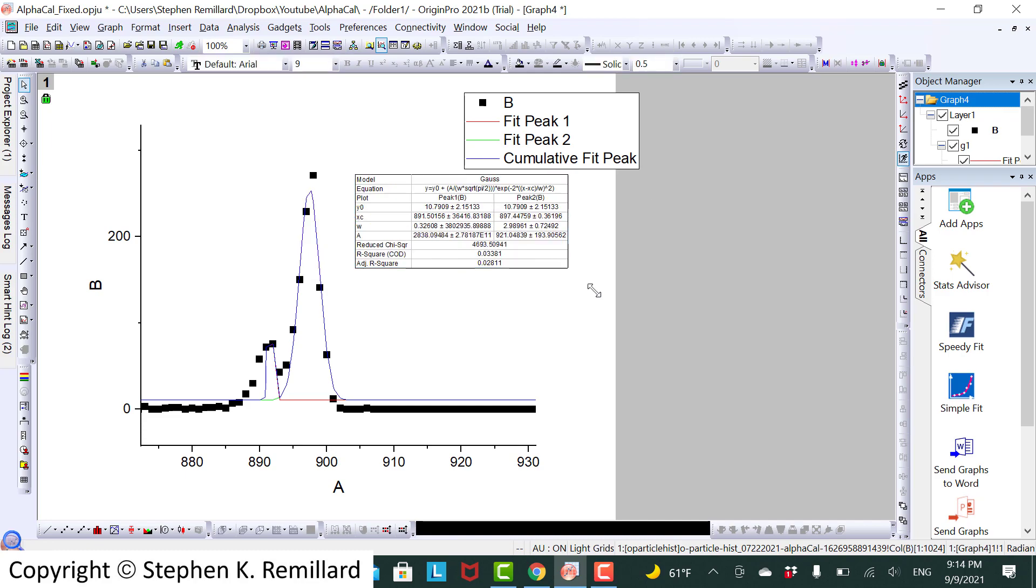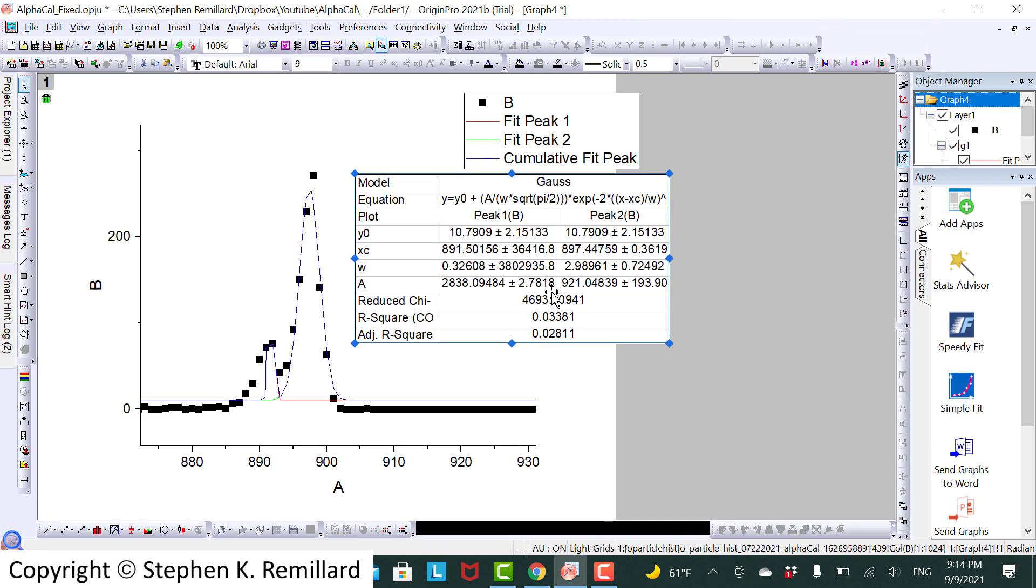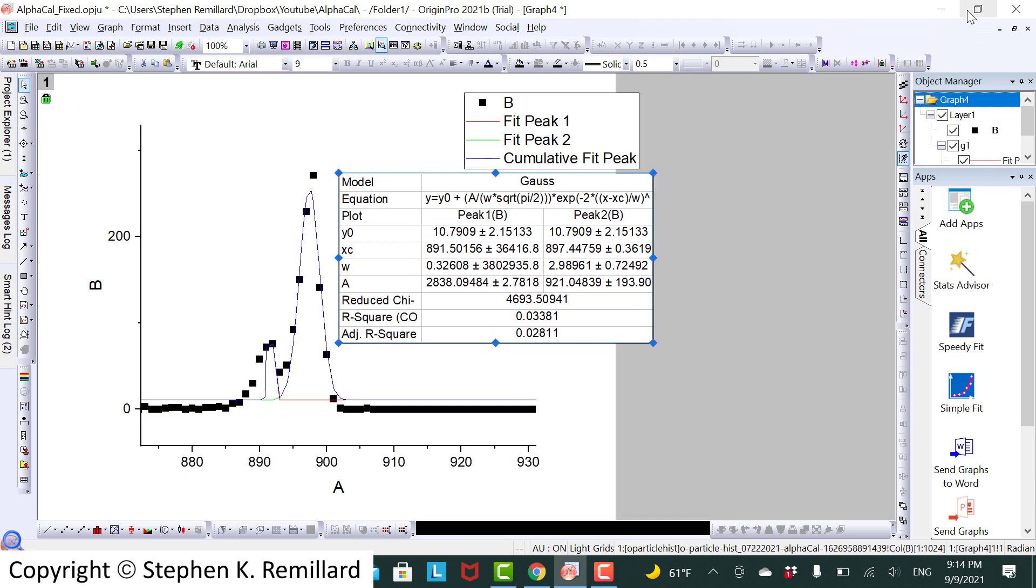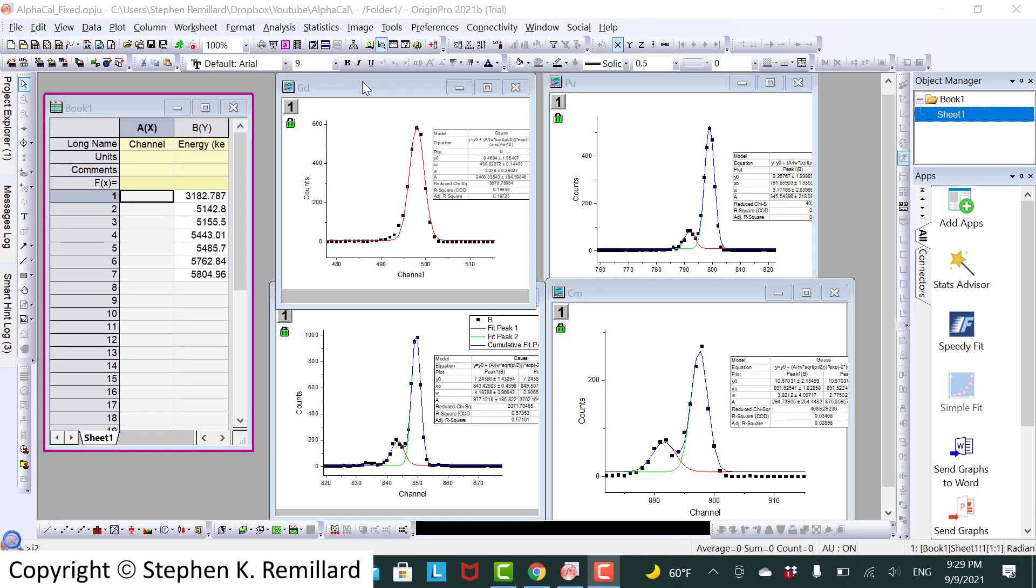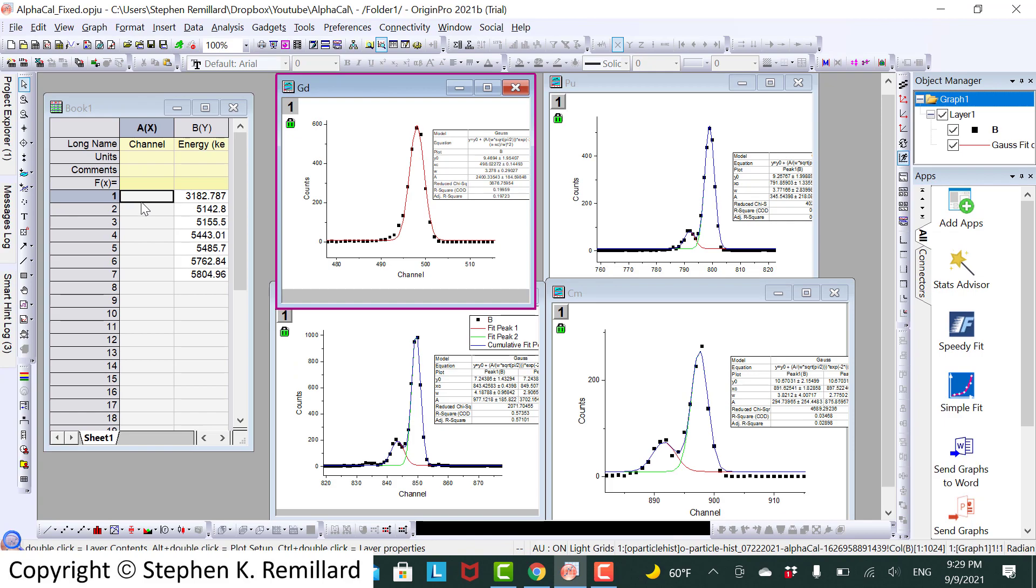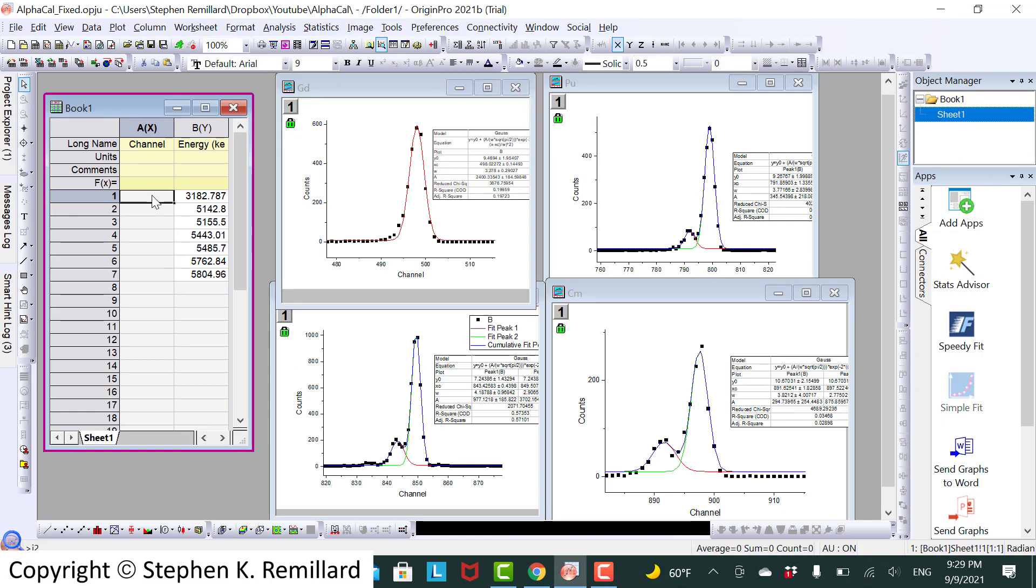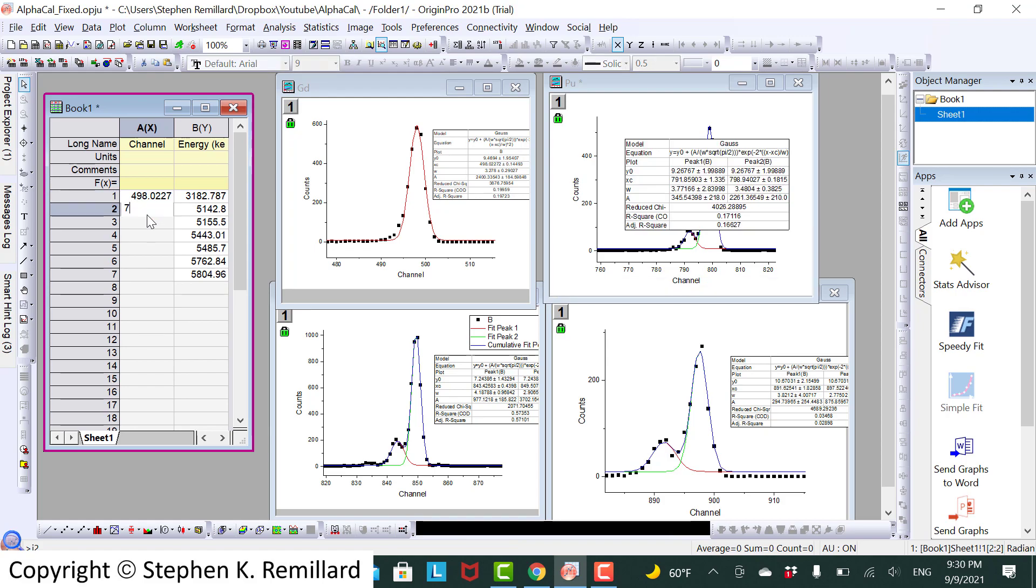And we can put all of these into a spreadsheet where we have the independent variable is the channel number. The dependent variable is the energy from our calibration certification. We'll put in the channels for each of these. The gadolinium peak was at channel 498.0227.